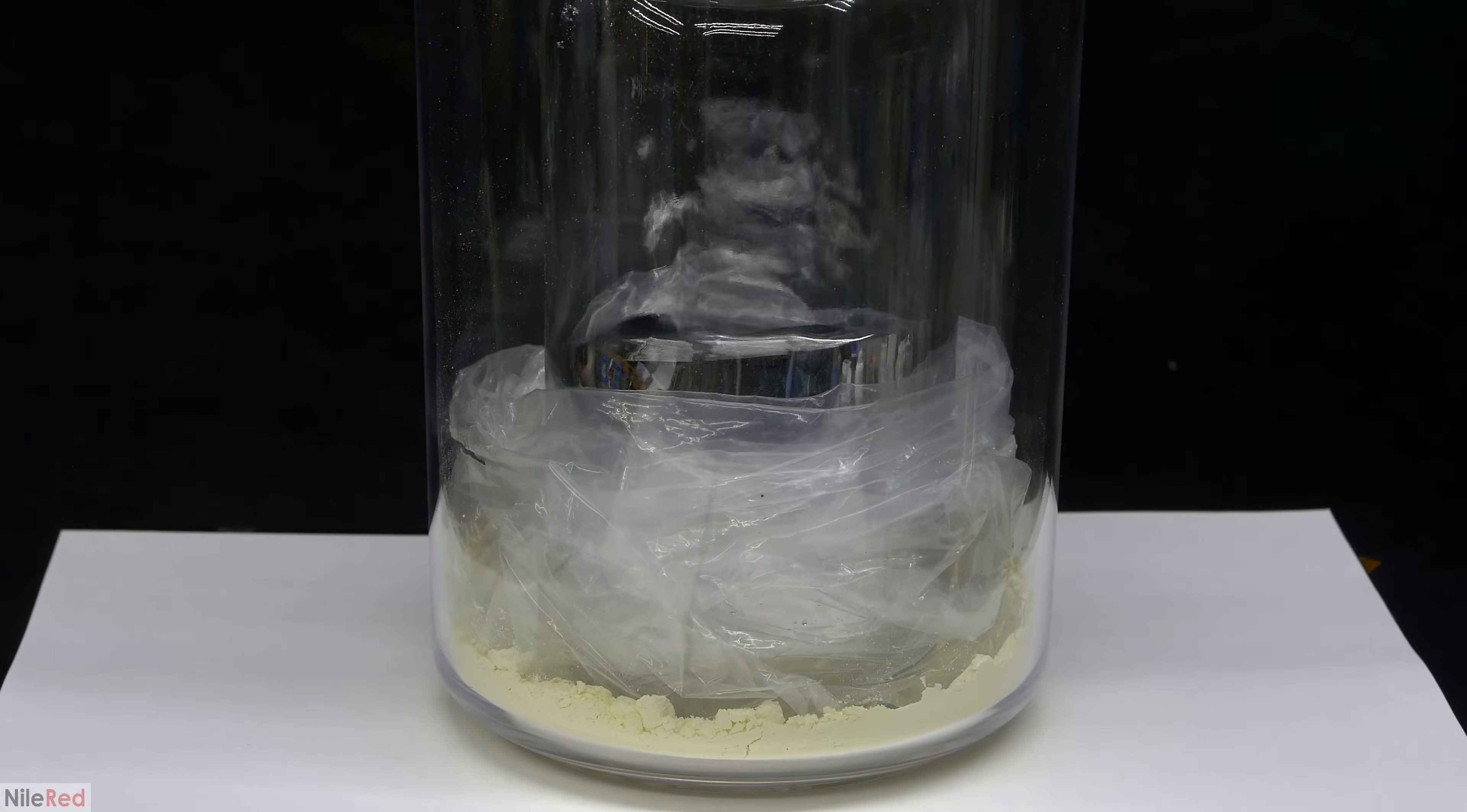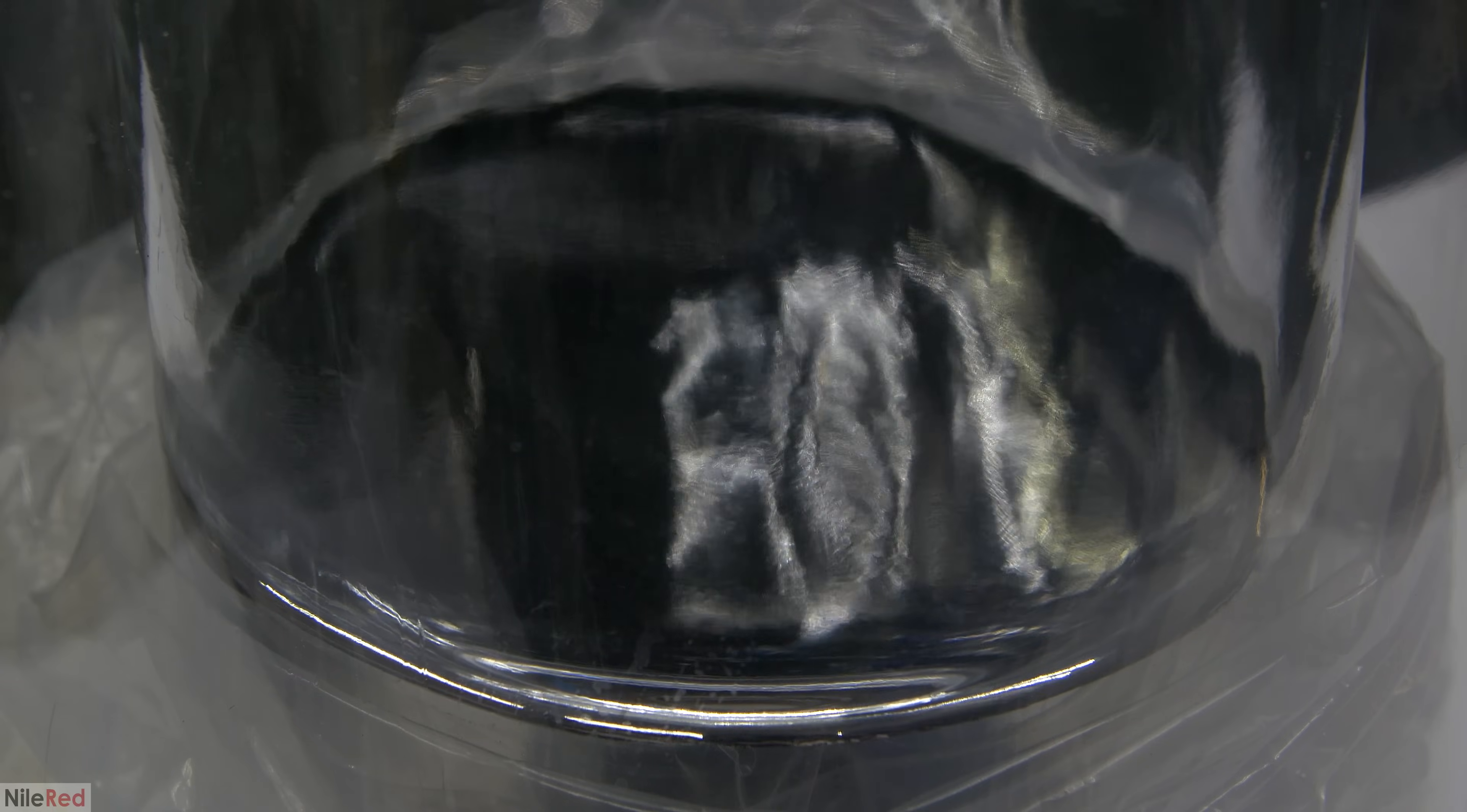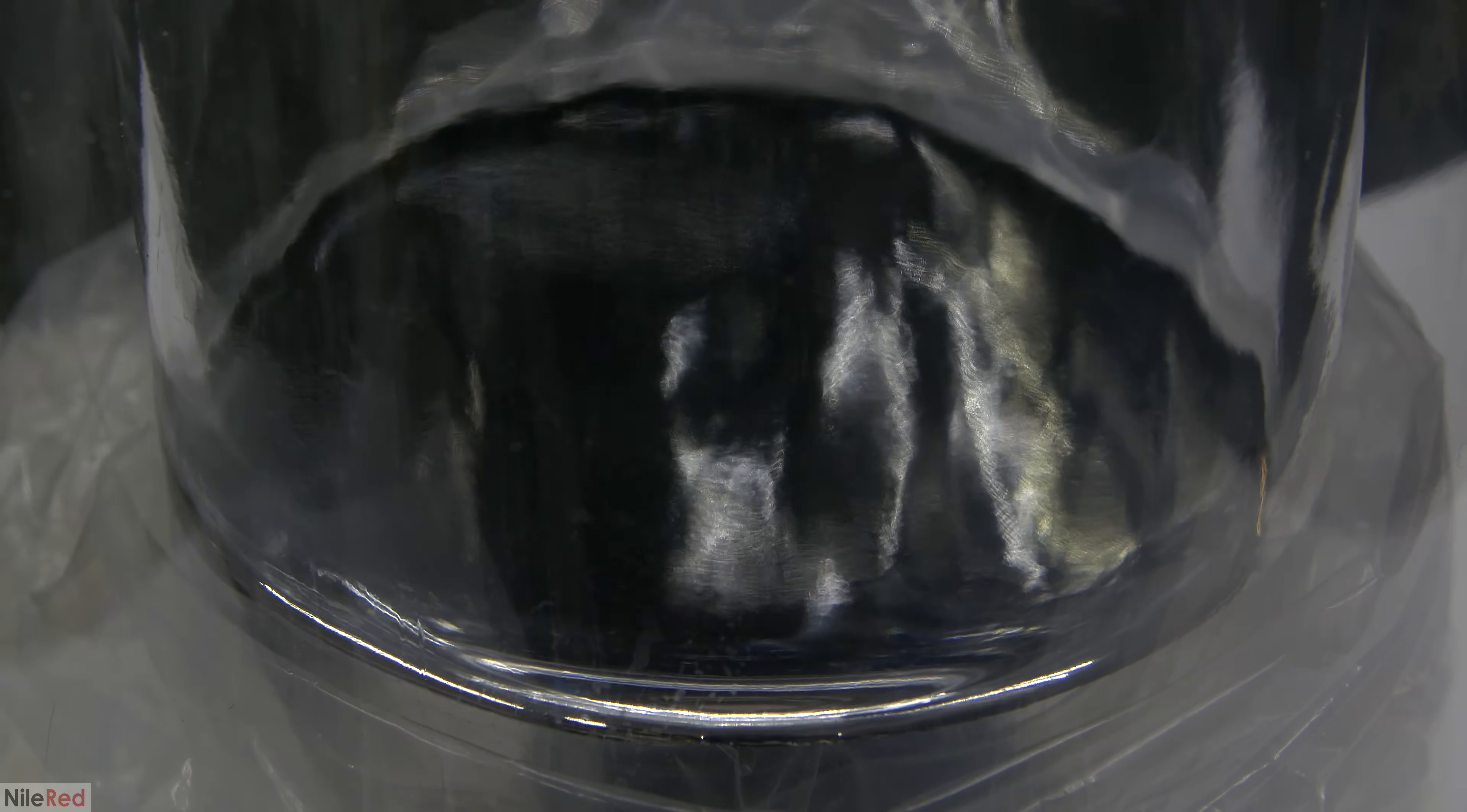In the end though, I think this is mostly fine as long as I don't throw it across the room or knock it off the table. I just have to be really careful when I take the bottle out and go to pour the mercury, because if I were to drop it and it shattered, it would be pretty catastrophic. Anyway, I guess I'll see how this water-free mercury holds up with long-term storage.